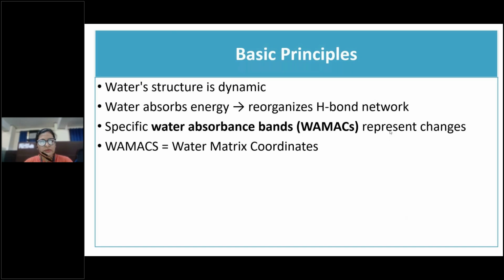So let's talk about some basic principles. You would be studying the bands from 700 to 2500 nanometers. There are some specific wavelengths which reflect water bands, which reflect water changes.